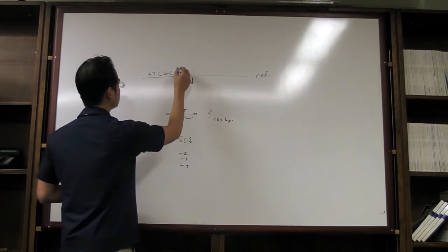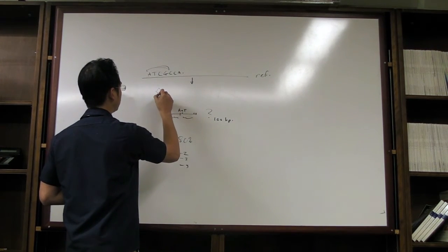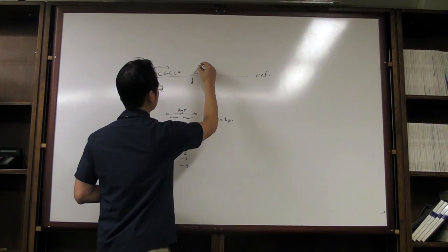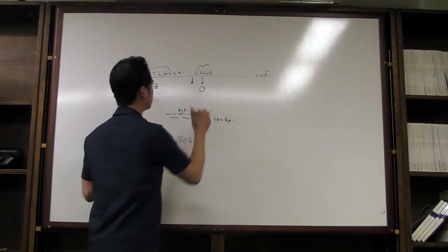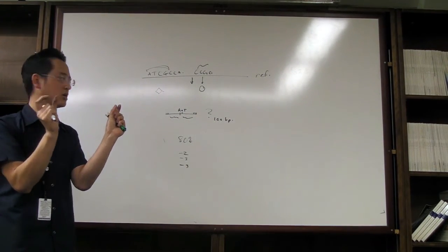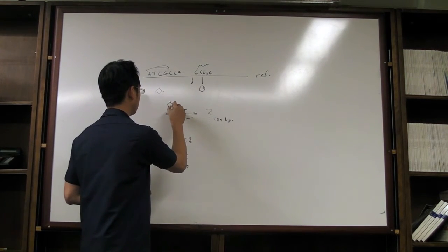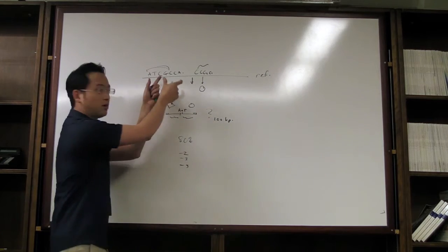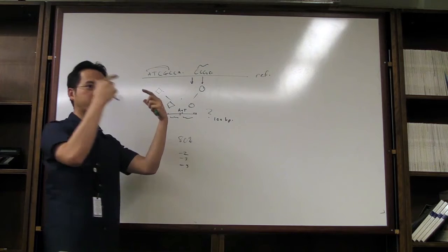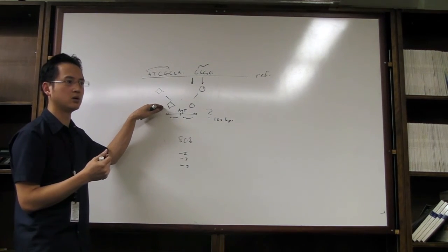Maybe it says, take this type of sequence here and make it shaped like a diamond for me. Take this type of sequence here and make it shaped like a circle for me. So it's sort of taking a bigger problem and shrinking it down into a more organized manner. And then take my read and do the same. So this could be a triangle, this could be a circle. And then now do the similarity. Oh, this matches, and then open it up and see what's in detail underneath. So that's how you can get much faster aligning.